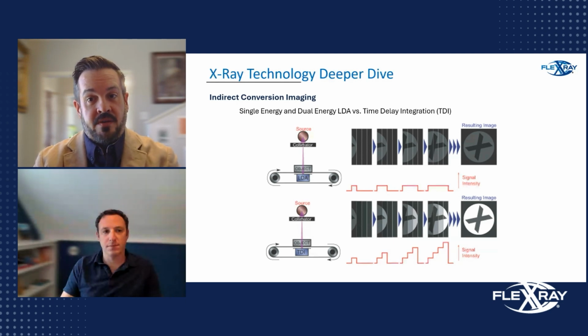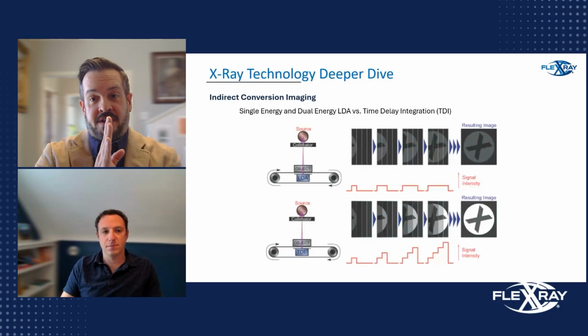There have been significant improvements, though, in the last few years with a different diode called a time delay integration. This is fully leveraged in photon counting technology that's in the marketplace now. And the main difference is it takes that information as it goes from one diode strip to the next and passes the data along as it goes.